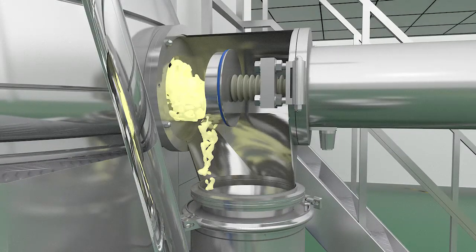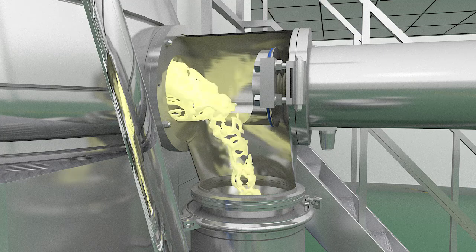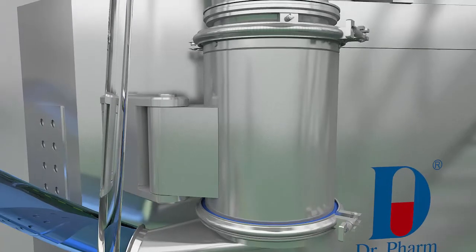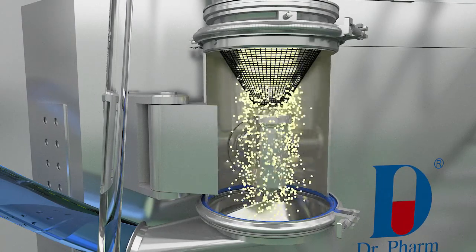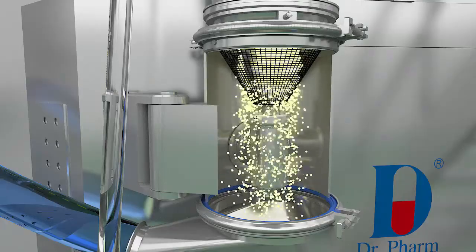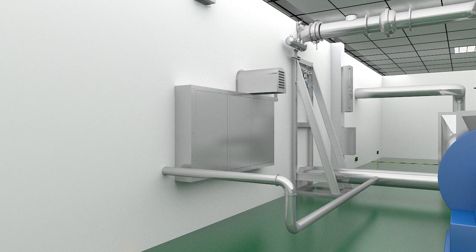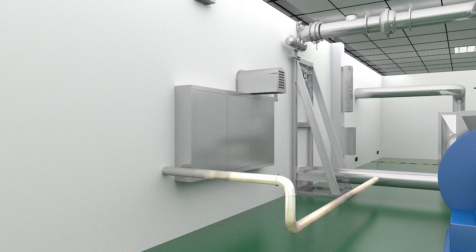Online co-mill: open the discharge valve to smoothly discharge the material into the co-mill, which has obtained patented technology. The bulk material is broken up by milling and then close conveyed to the fluid bed dryer through the pipeline. The unique hot air supplement system connects the hot air purified by the fluid bed air inlet system to the discharge port of the high shear mixer through the pipeline to replenish the hot air so that material transmission is smoother.